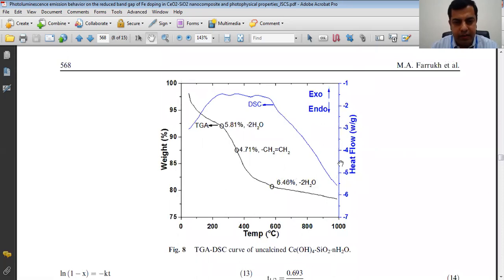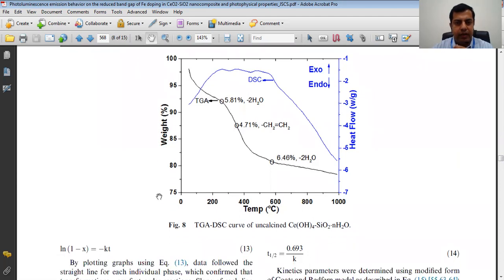This is the first graph, the basic data for the TGA-DSC curve of our uncalcined sample which is cerium OH4, silicon oxide, and water molecule. We have taken this as the base material to characterize this material as well as to calculate the thermodynamics and kinetic parameters. This is the TGA curve and this is the DSC curve. I will talk about the TGA curve. There is weight loss with the change in temperature.